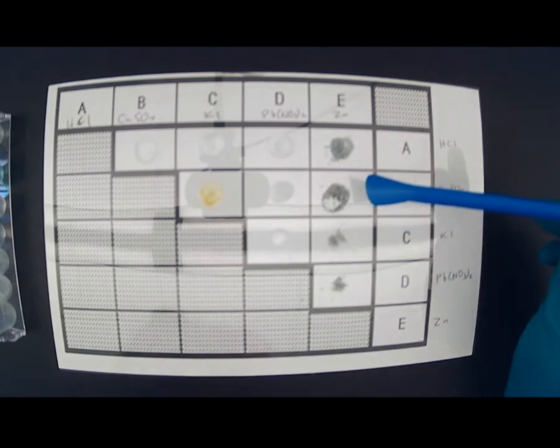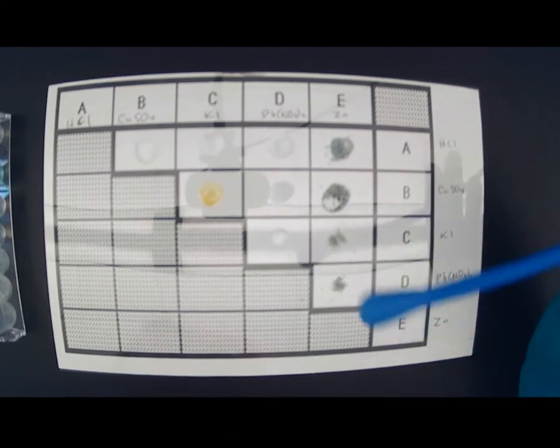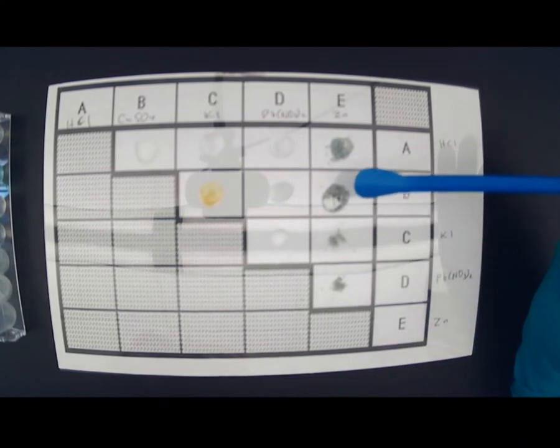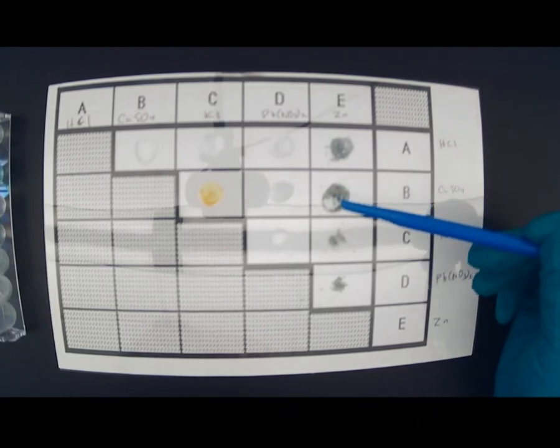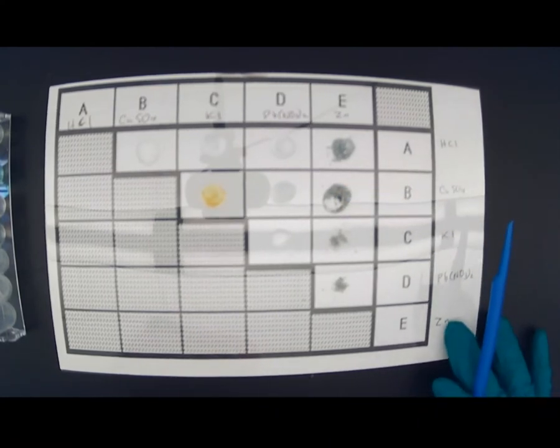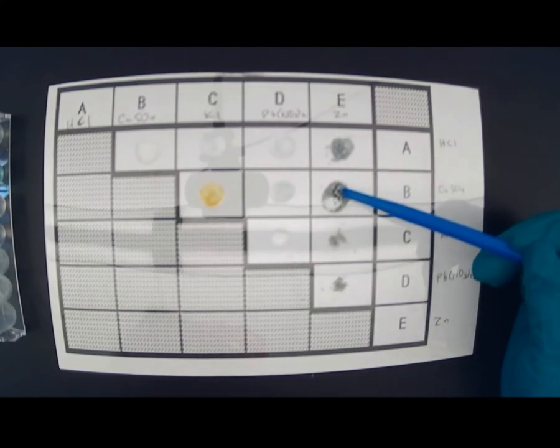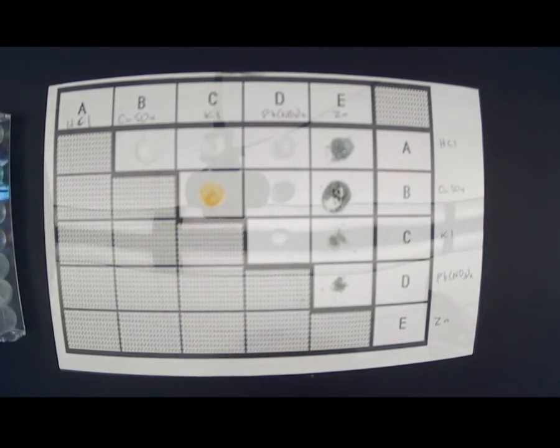You can see some black forming underneath. When I put the drop in, some of the zinc ended up floating, and the one that's floating you can't really see what's happening because it's at the surface. But the one that has actually sunk to the bottom — you can see that it's darker. Now this one's contaminated from touching it.